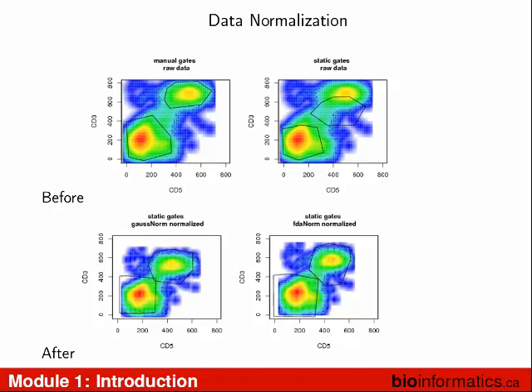Normalization, you have, here's a whole bunch of data that looks like this, and then later you have a whole bunch of data that looks like that. So you're trying to move gross sets of data. So this might be a different problem than when you're doing just adjusting of gates versus wholesale moving of data.